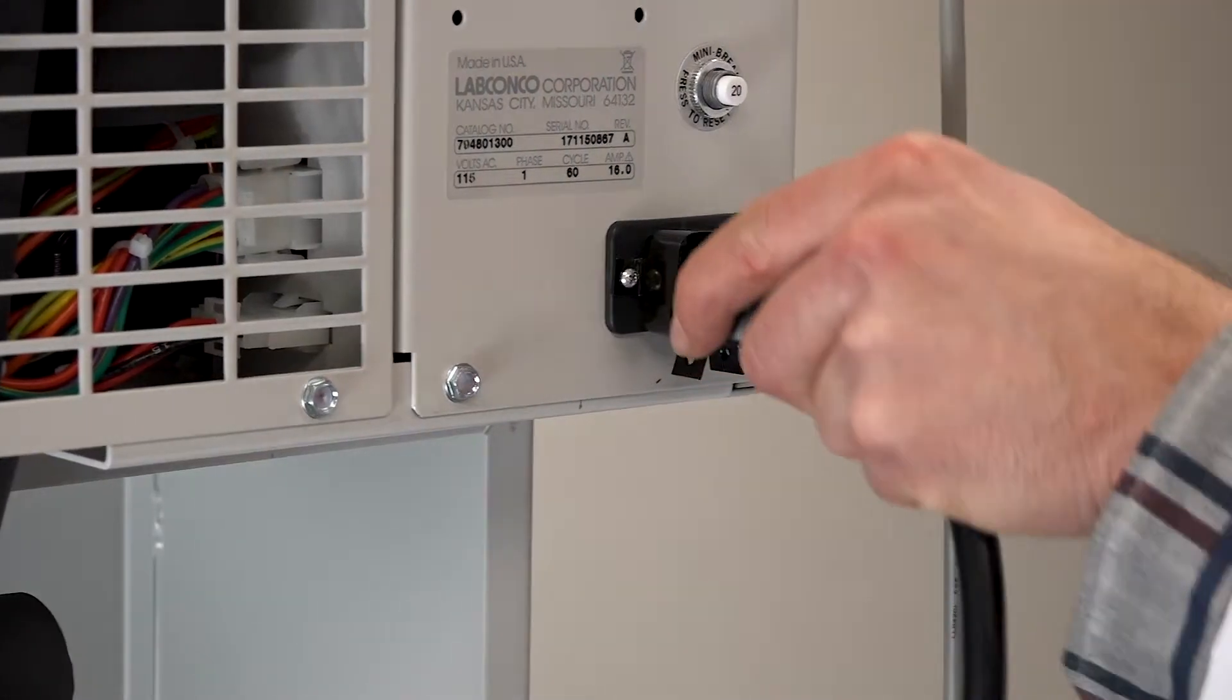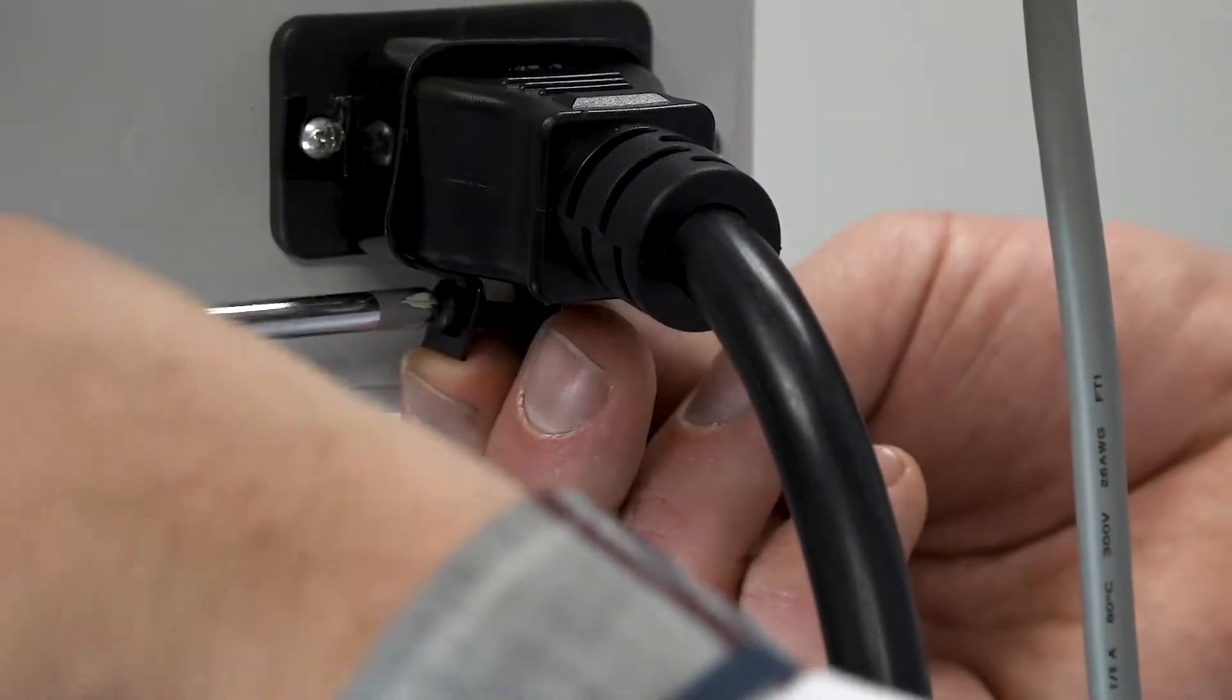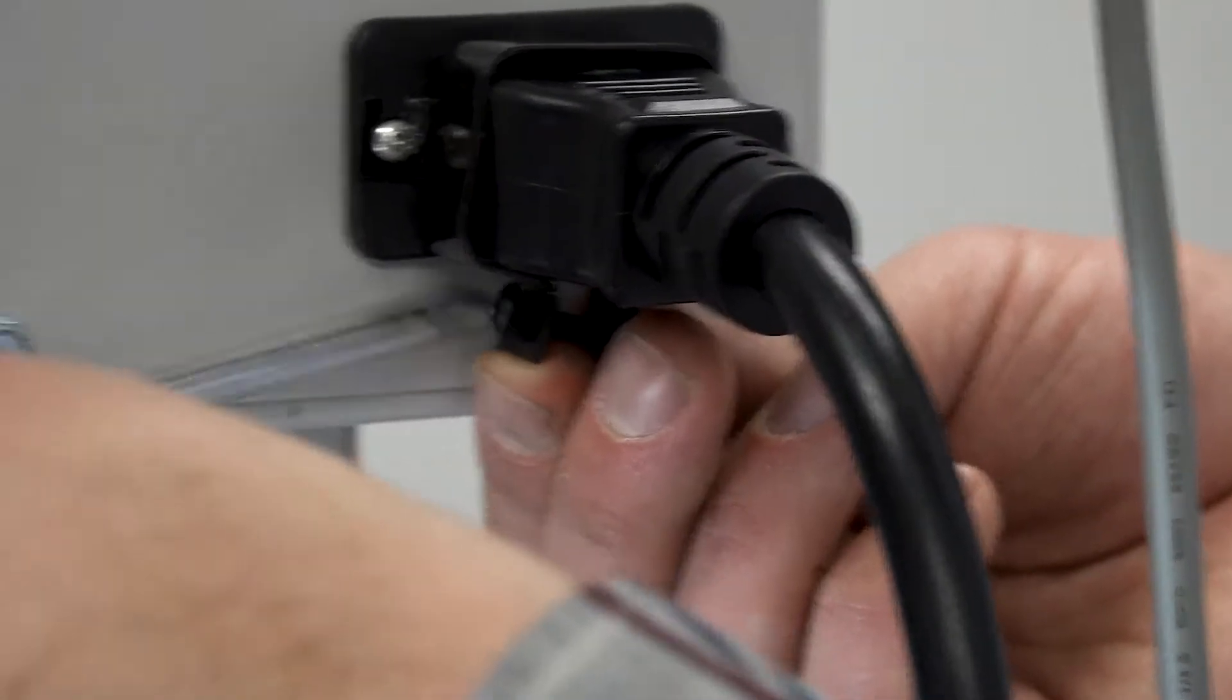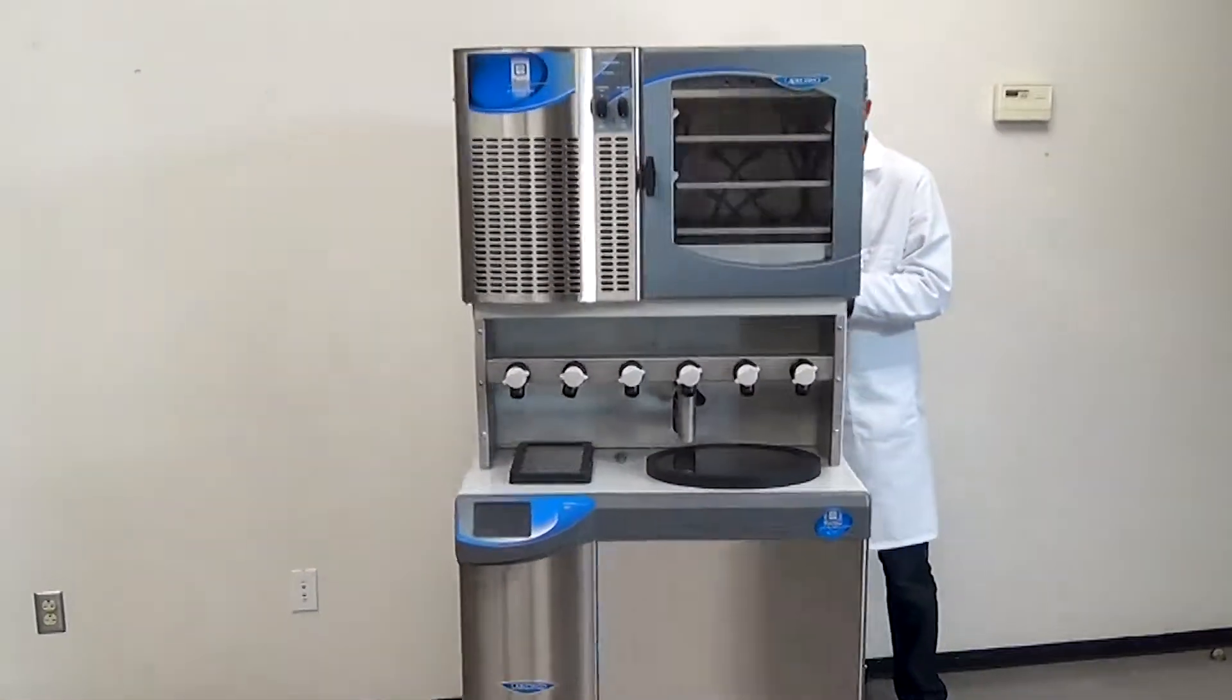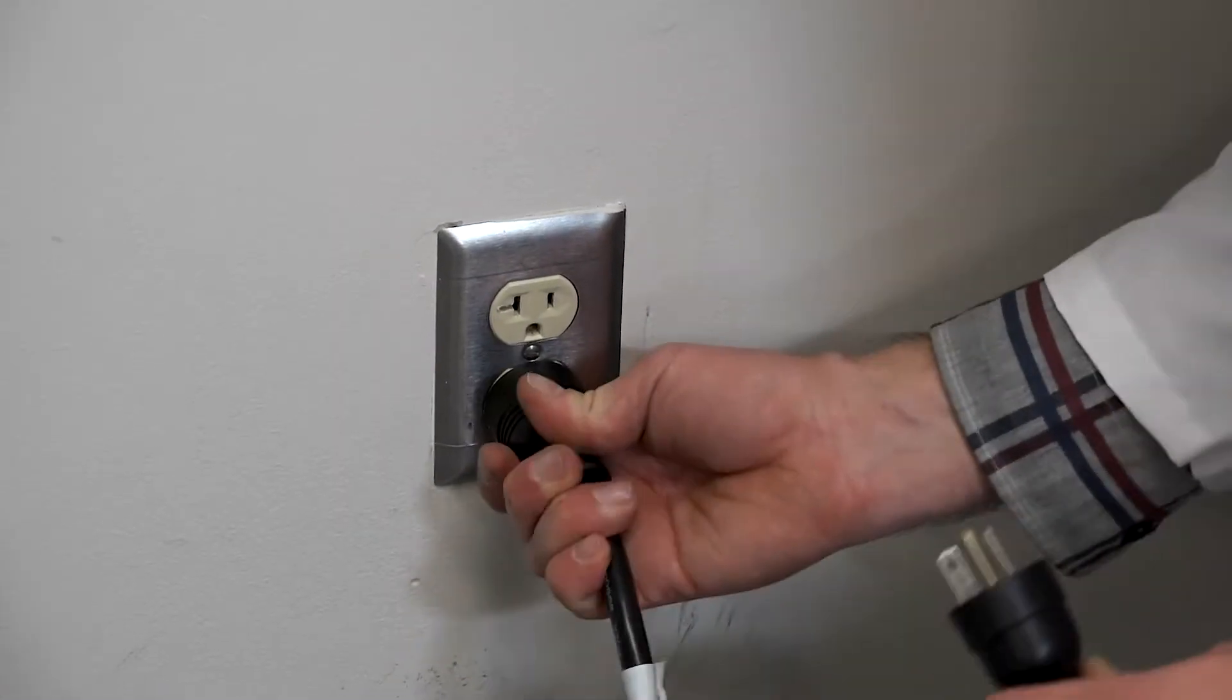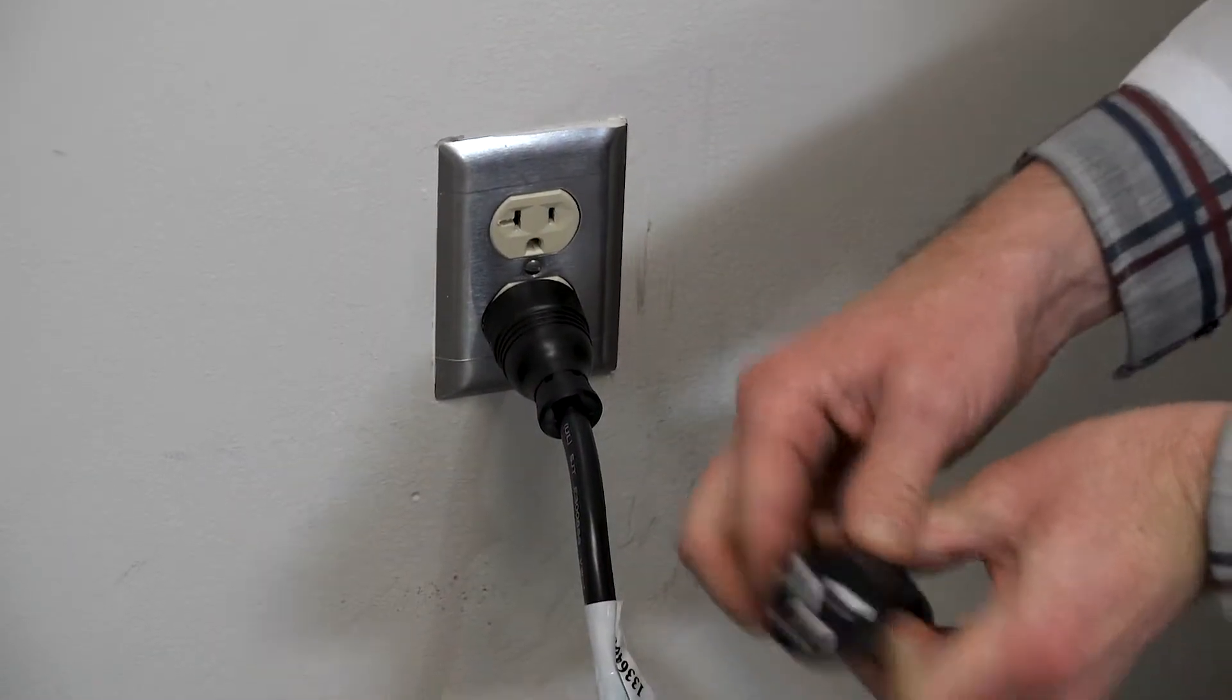Plug the power cord into the receptacle on the back of the stopper and tray dryer and plug the other end into a suitable power receptacle. Do not attempt to plug the stopper and tray dryer into the FreeZone freeze dryer.